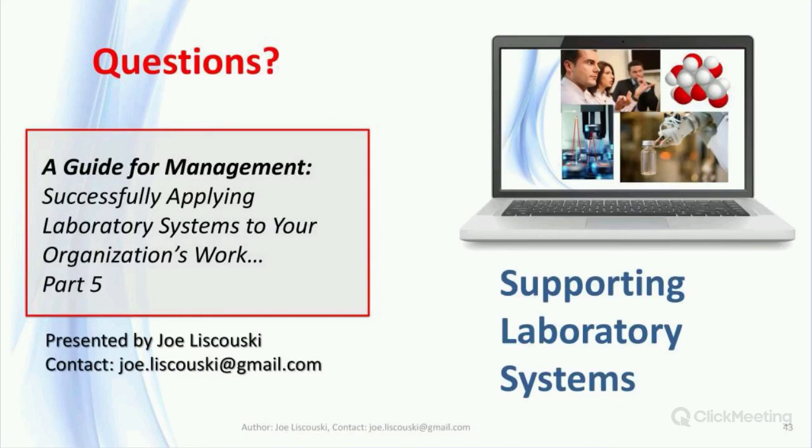And having everybody be at the same operating system level is not exactly a good priority. The main thing you've got to do is keep the labs running. And that happens frequently, particularly when you're dealing with small vendors. So the primary strategy is communications, letting people understand what the priorities are, what your support strategies are, and making sure the vendors are going to be providing timely support as needed. And if an implementation or an upgrade has to be delayed, let people know soon enough so that they can incorporate that in their plans.